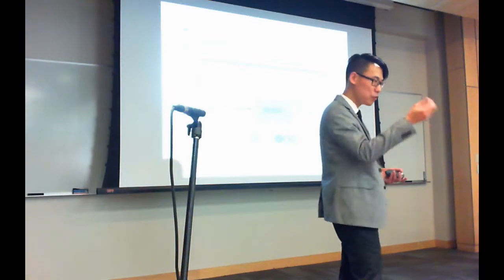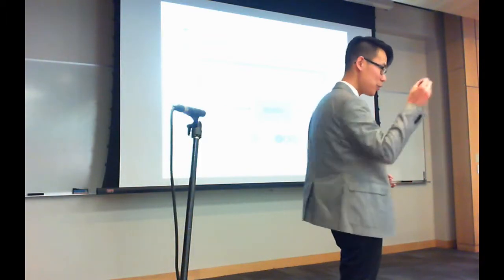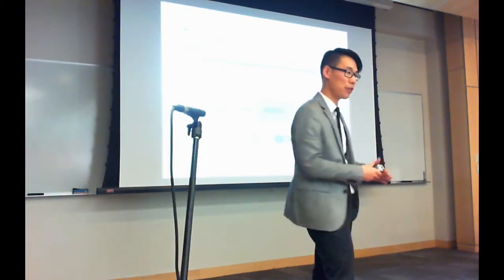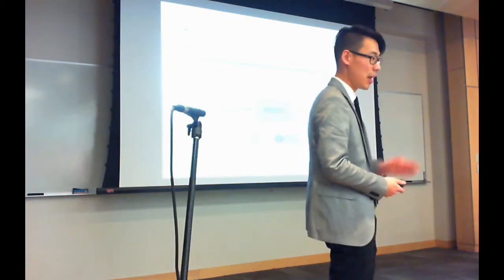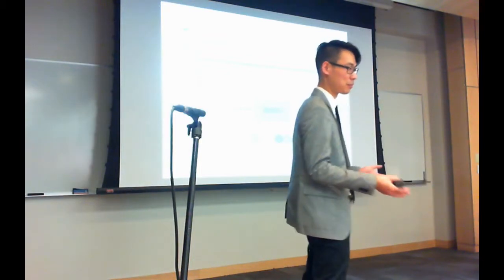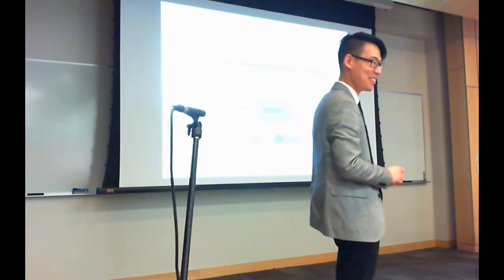So you can do this, and if you can truly get 0% FDR, that's great. But then your library is going to be a quarter the size or even smaller than that. And then it's not really useful for the community because it doesn't cover very much. Are you convinced, Pavel? Yes.